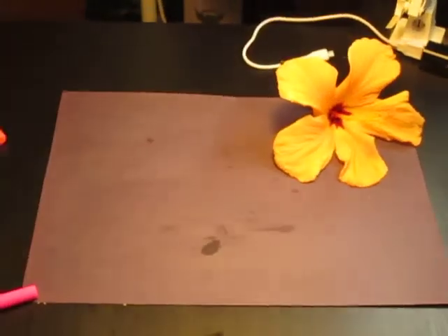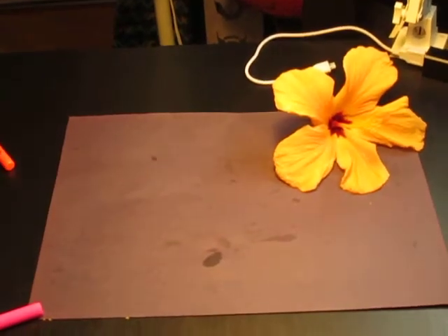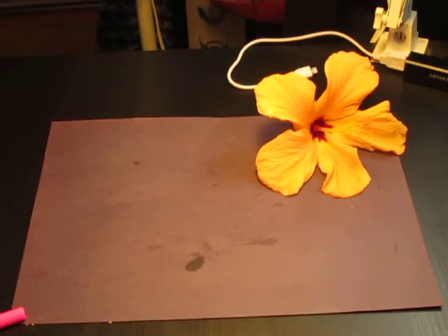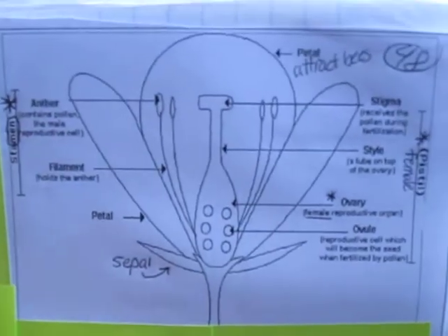Bebermeyer. This is the dissecting a flower video that we are going to do next. We planted our radish seeds and now we are going to review the parts of a flower and dissect it. Before we get started, I wanted to just remind you that there is this resource.